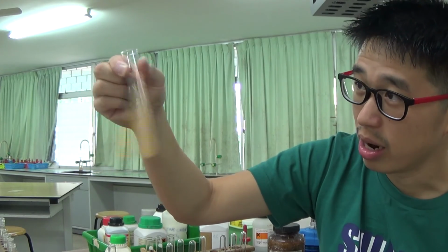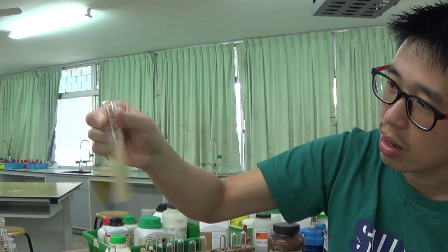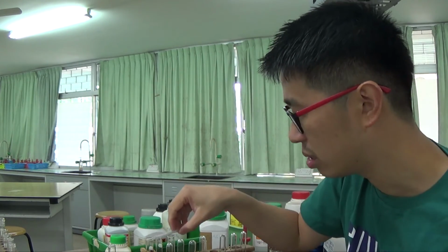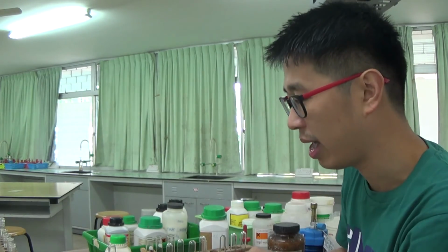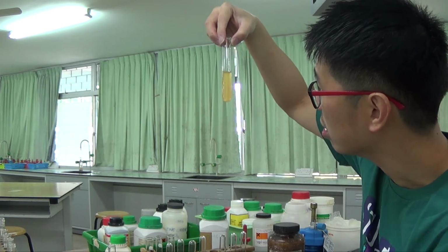Just like sugar, right? Sometimes you need a bit of heat to dissolve stuff. So I will let it settle for a bit, and then I will separate them out into the test tubes. I do not want to use the dropping pipette because I used it for my Al3+ ion just now. It's starting to settle.